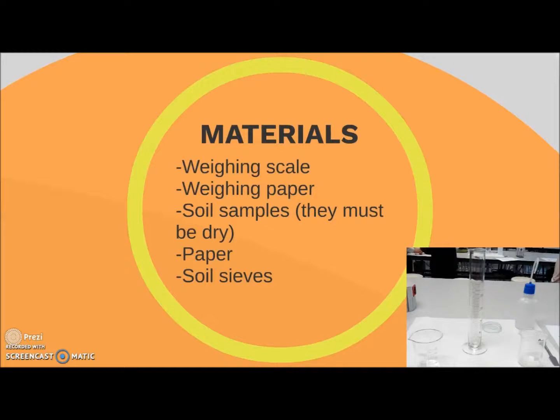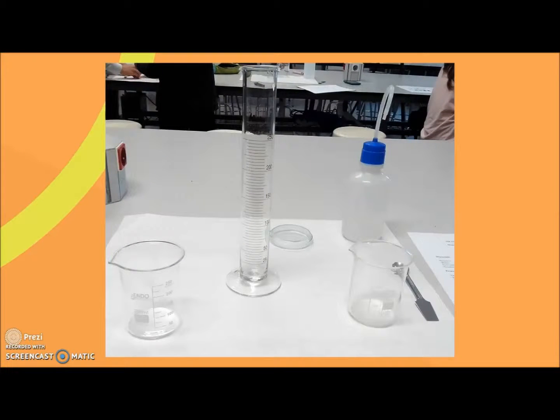Materials. Weighing scale, weighing paper, soil samples, they must be dry, paper and soil sieves. Here we can also see all the materials used to make this project.